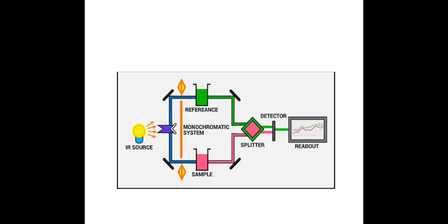IR source, reference and monochromatic system, sample, splitter, detector, and readout.